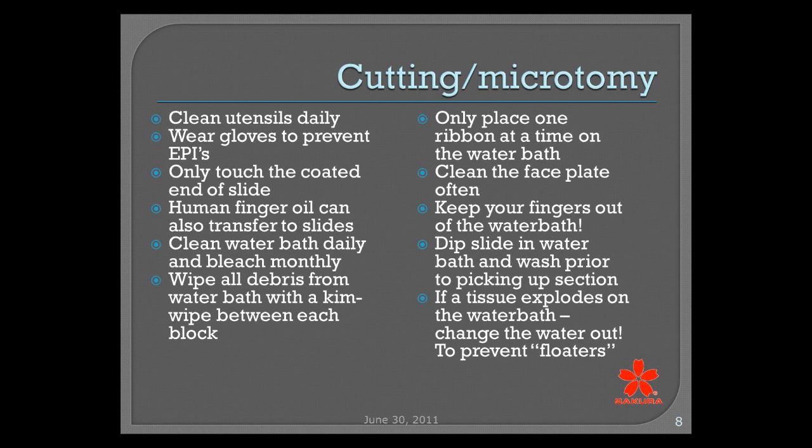As far as our water bath goes, we need to clean our water bath daily and bleach it monthly or weekly. I tend to do it weekly just because that's my nature. But if you are just cleaning your water bath daily with soapy hot water, you might get yourself in the position where you've got things floating around in there.